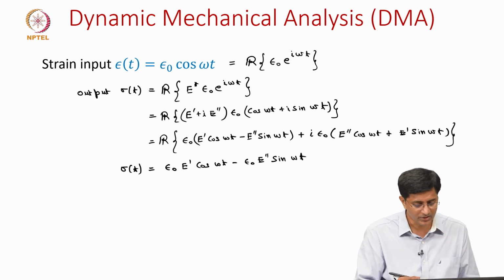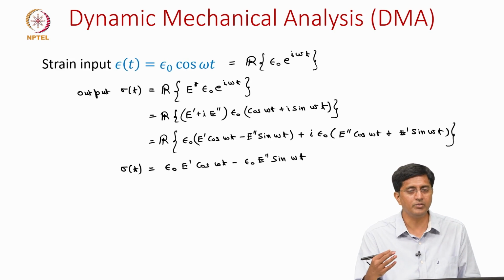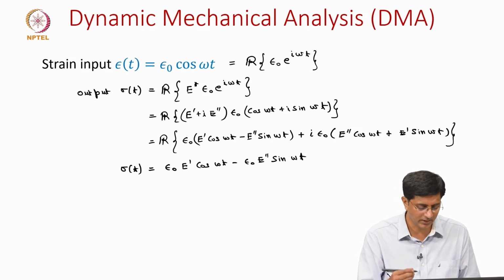But having found this, now let us see how we bring in the phase lag or the delta.